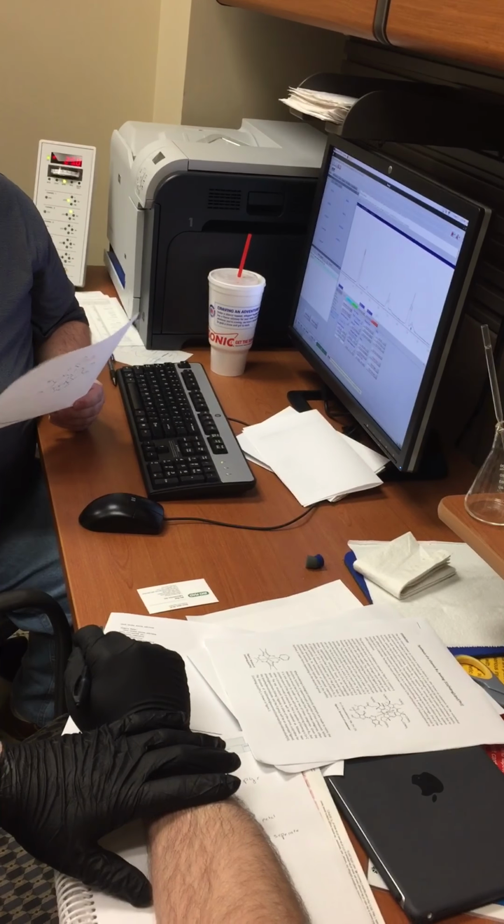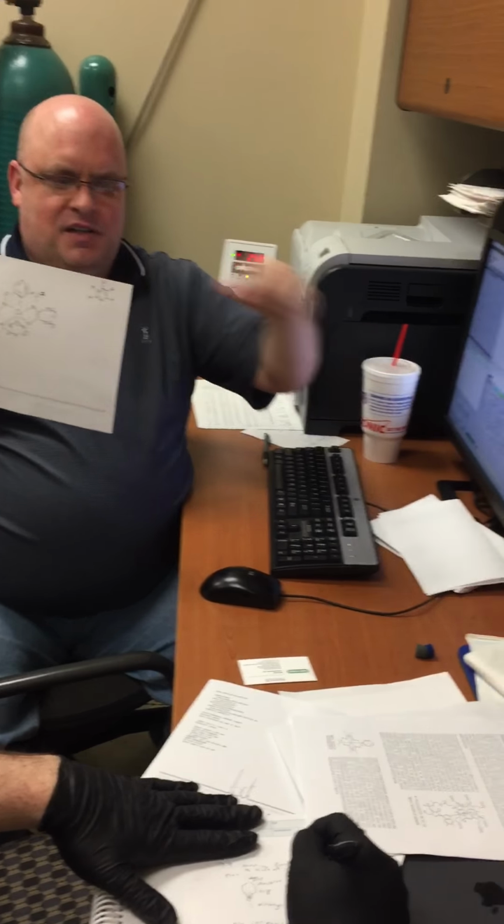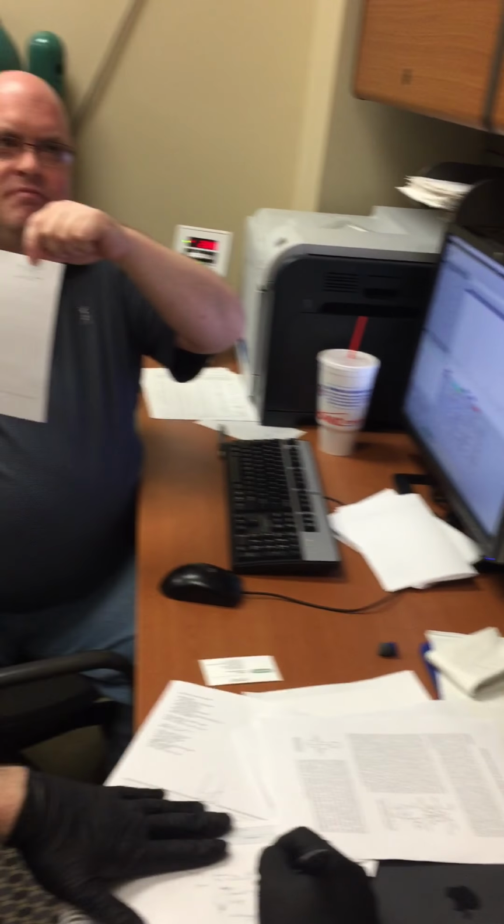This is the real world. So we have 2 triplets here. Which one is probably going to have a bigger integration? This one. So this one is going to be the meta hydrogens to the nitrogen, and this one is going to be para. So triplet, doublet, triplet, coming all the way down.